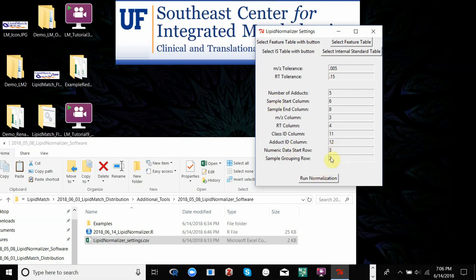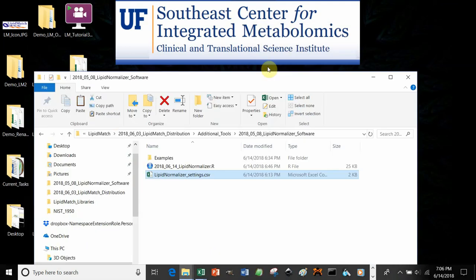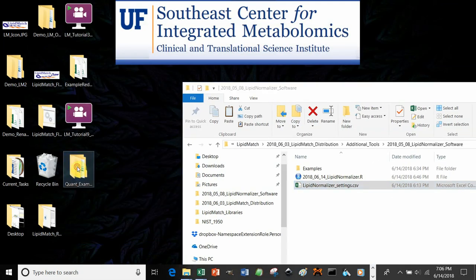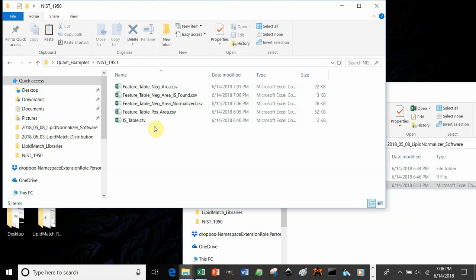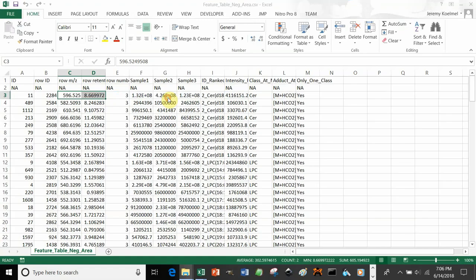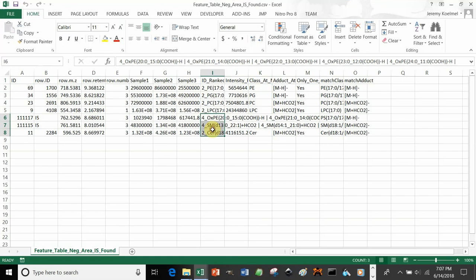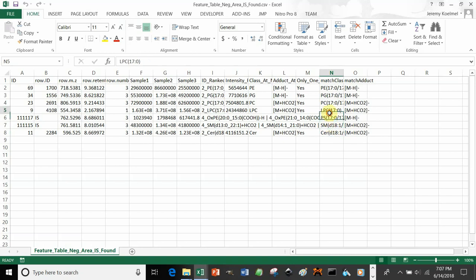After making sure your feature table and internal standard table are loaded, click Run Normalization. It runs very quickly. In your folder, you should have the feature table with the internal standards found — the PE, PG, PC, and LPC. Even if they didn't have names in the feature table, it can still find them by retention time and mass-to-charge. The names of the internal standards found are shown in the output.